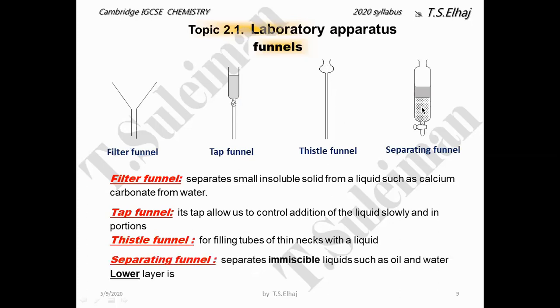Separating funnel is a very important type of funnel because it separates immiscible liquids such as oil and water. Immiscible liquids are liquids that do not mix with each other. As we mentioned, oil and water do not mix with each other.